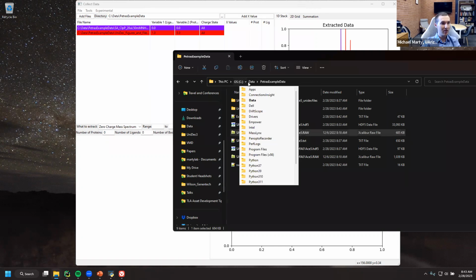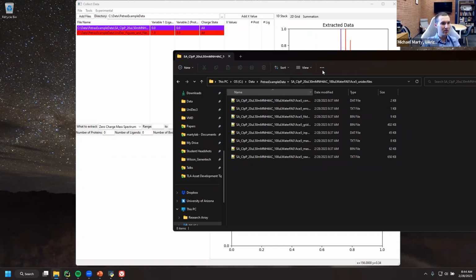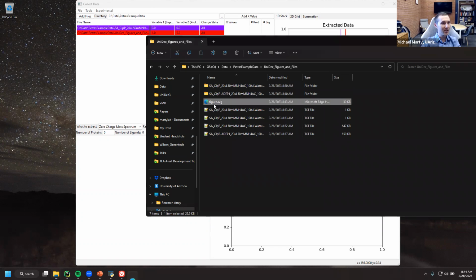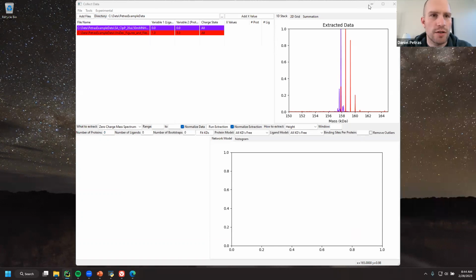Let me go back here. Sorry, I think it's under here. Nope, sorry, hold on. SVG may not be supported. Let me see if I'm getting an error. Oh no, I just am looking in the wrong place. When I looked at the background, I figured out where it was. It's in here. Yeah. So then you could open this and it's going to look like you'd expect. Nice. So yeah, it's all vector, right?